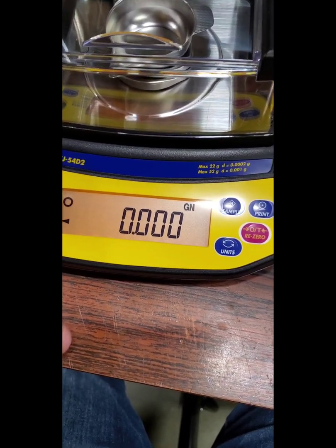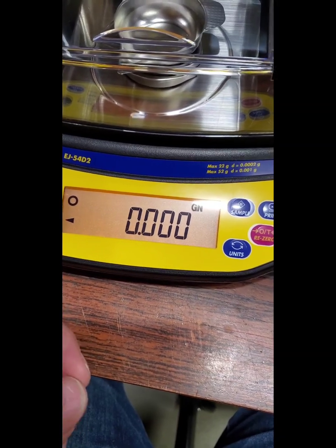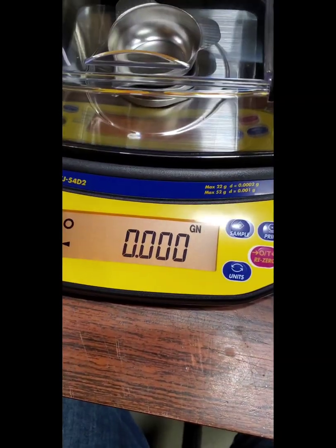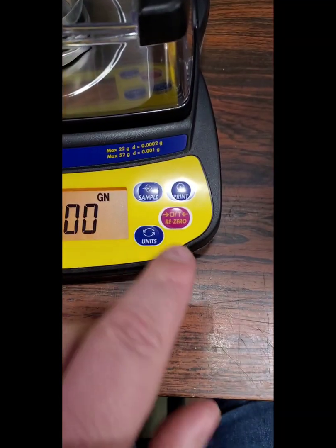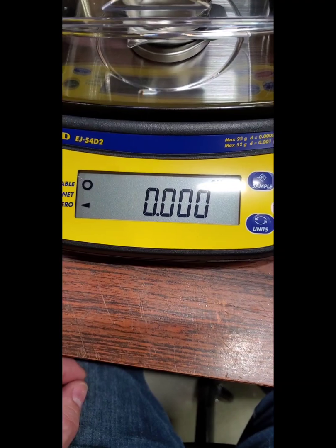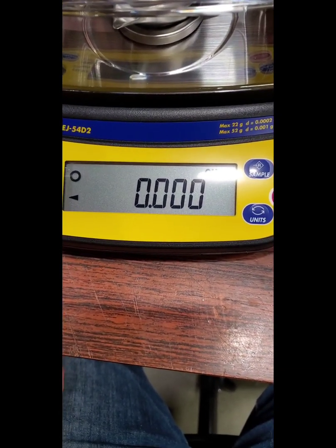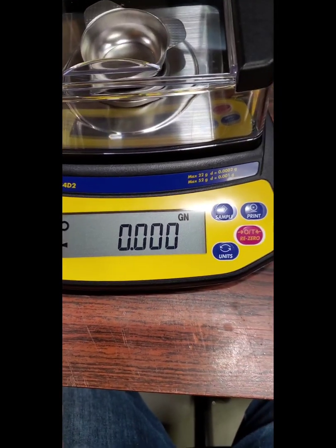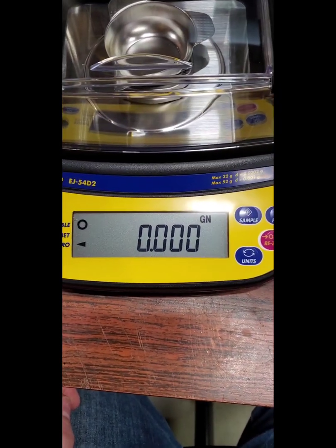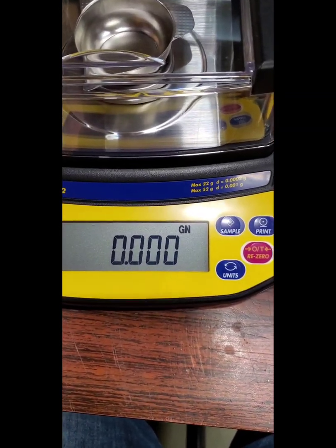That is a bit of a pain in the ass. You got to slide this cover out from the bottom and hold this button underneath. It's not super nice. It would be great if the calibration button was on the front, or, you know, was available through one of the menus over here. I don't know why they did that. I guess maybe the thinking is you only calibrate it when you move it from one location to another, so you shouldn't have to calibrate it as long as it's sitting on your bench and you haven't done anything stupid to it. So yeah, gonna pop off the dust cover again, or the wind cover, sorry, like that.